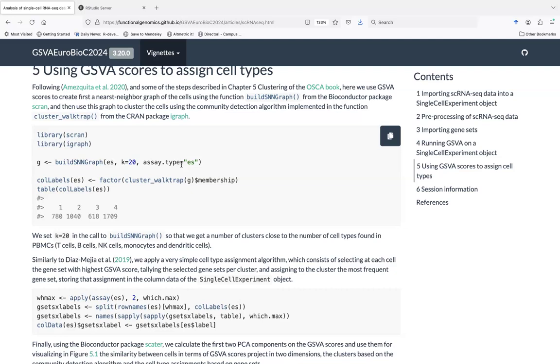What I can tell you is that the paper that described this, more than 10 years ago, is probably going to go over 10,000 citations by the end of this year. So if so many people use it, I guess that something good must be in it. 10,000 citations is not a trivial number.